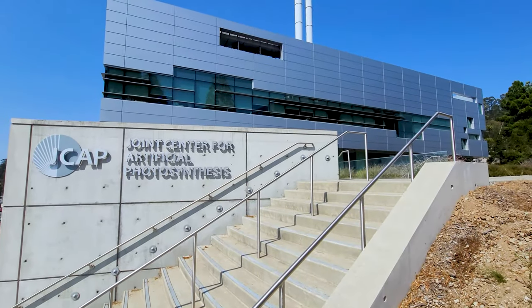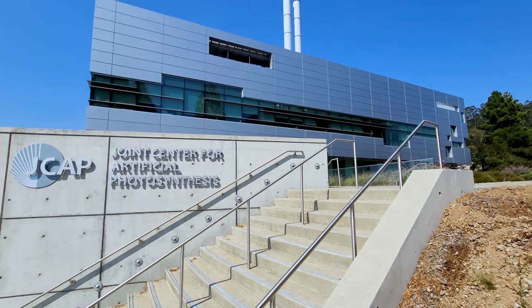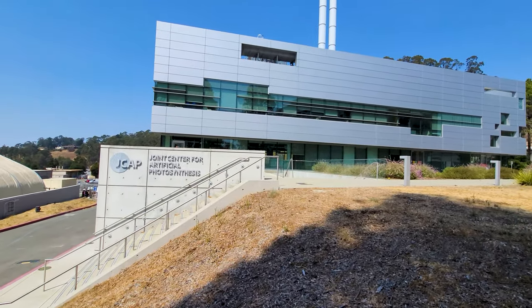Inside Building 30, home to the former Joint Center for Artificial Photosynthesis, JCAP, and now the Liquid Sunlight Alliance, LISA.